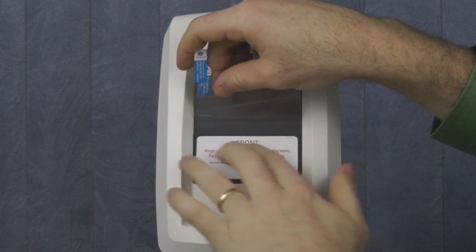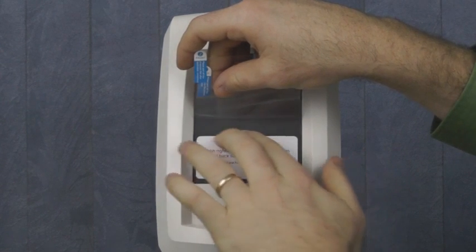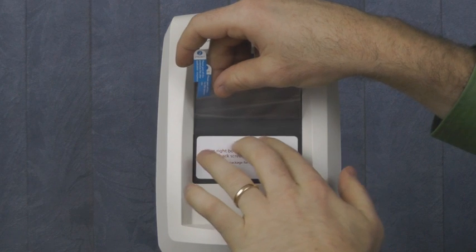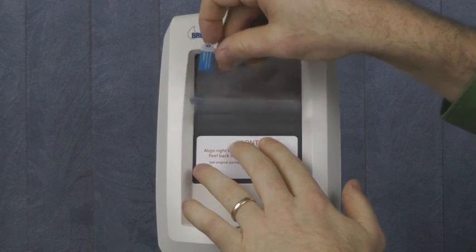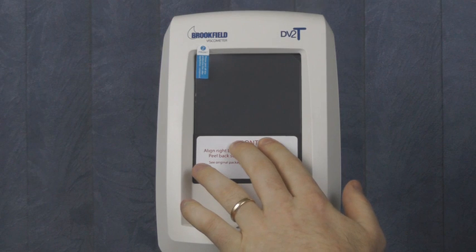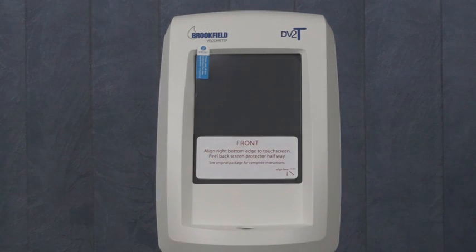Once aligned, gently press the exposed side of the protector against the screen, and then continue to peel back tab 1 until it is removed. Make sure not to touch the exposed surface of the screen protector.